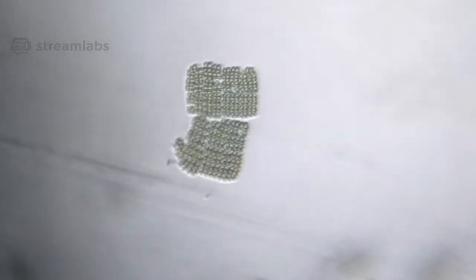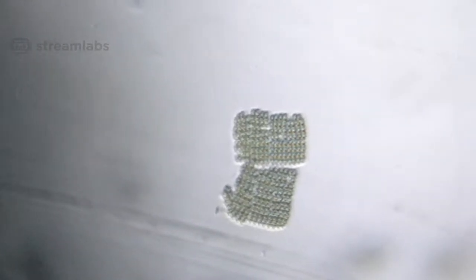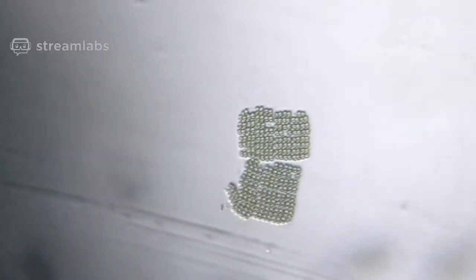And that is why I love the Foldscope. It is independent of what you do, what you study, whether you're a biologist or otherwise, whether you're an artist. You have your own way of looking at the microscopic world. And who knows, you might make a discovery that might help the rest of us. Okay, so this Merismopodia, brilliant.